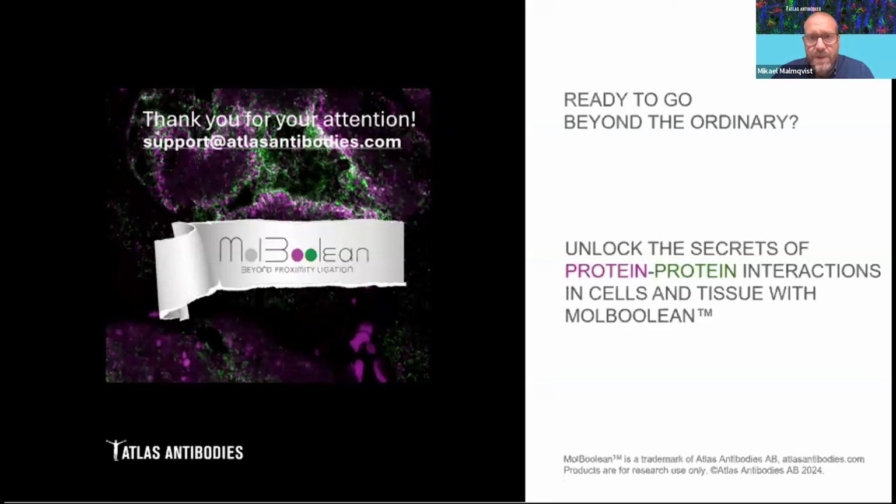Thank you for a wonderful presentation. For human samples, you mentioned that the assay has been used for FFPE tissue, but has the assay also been tested in frozen samples, and has it been used on post-mortem samples or just surgical resections? So I think what we have tested is FFPE.